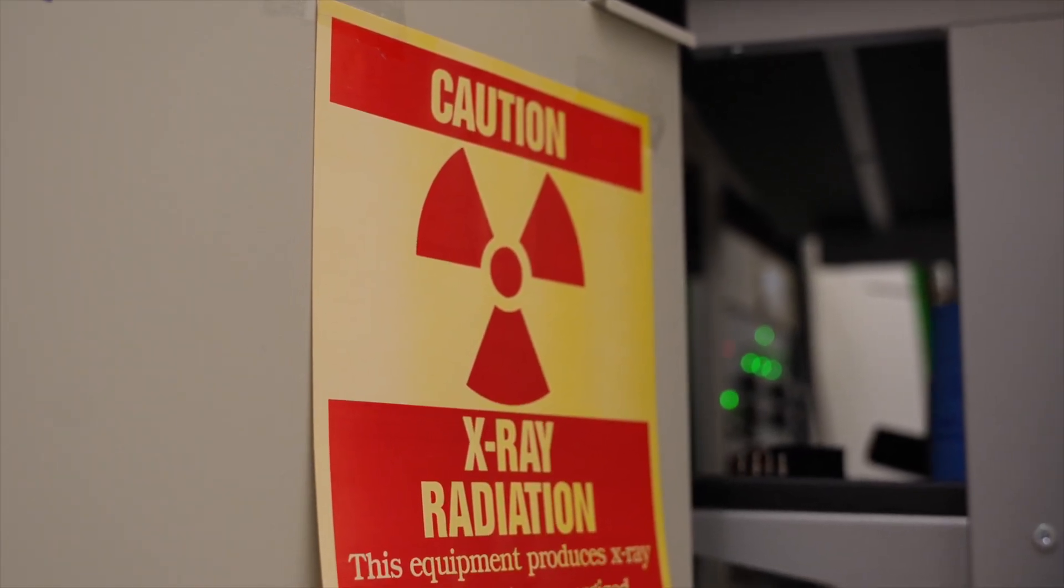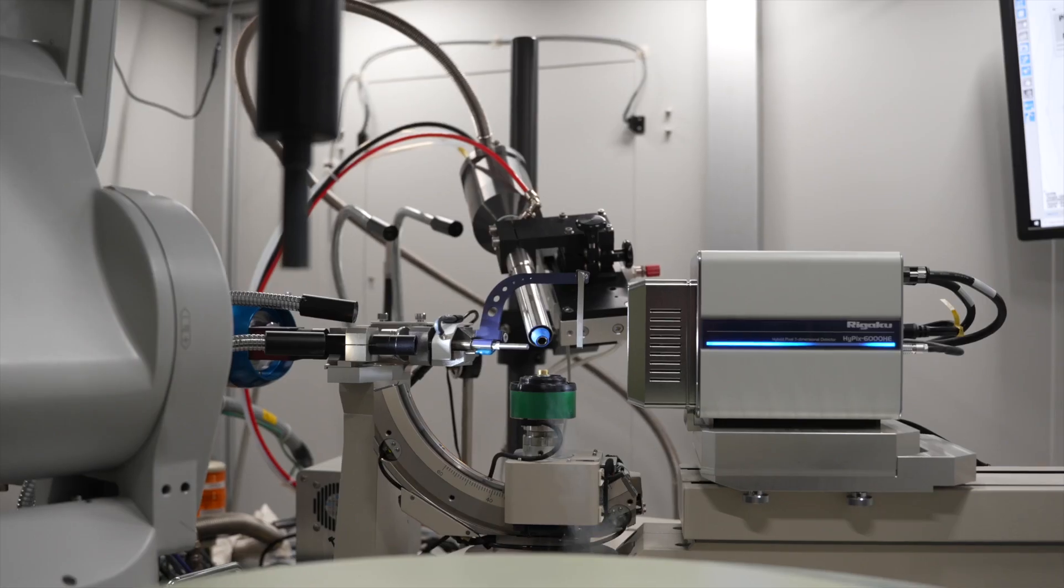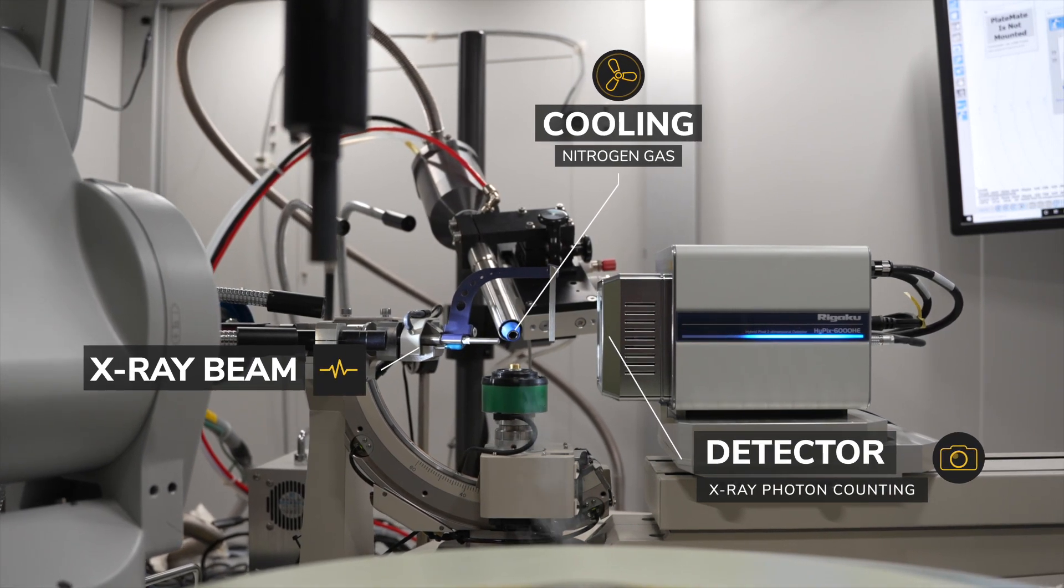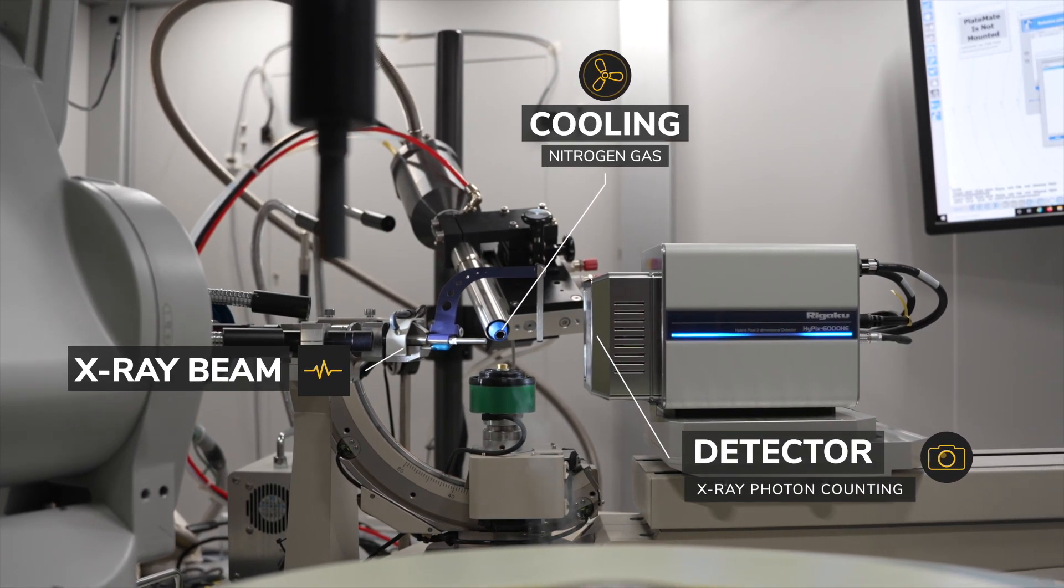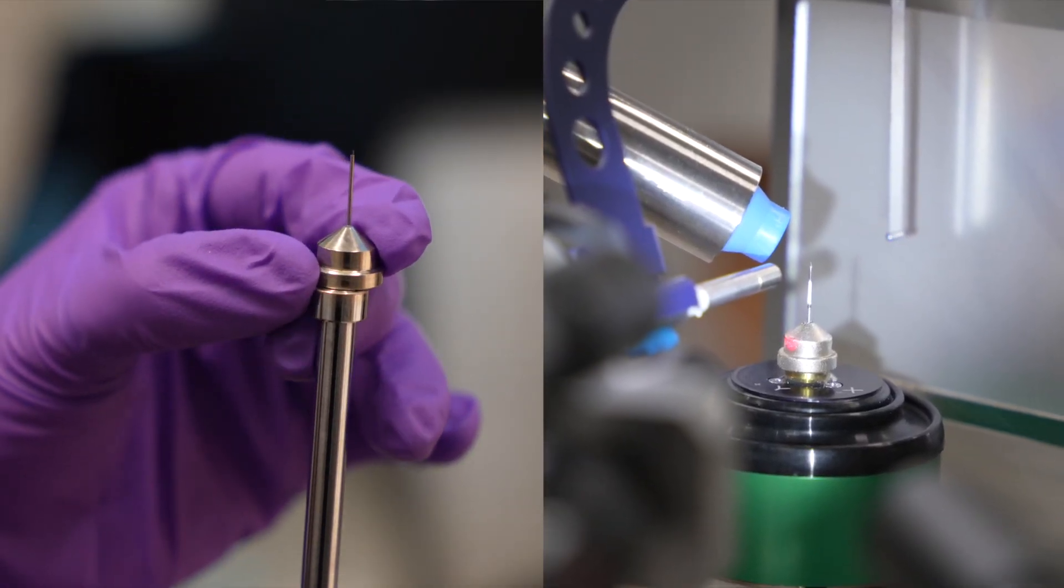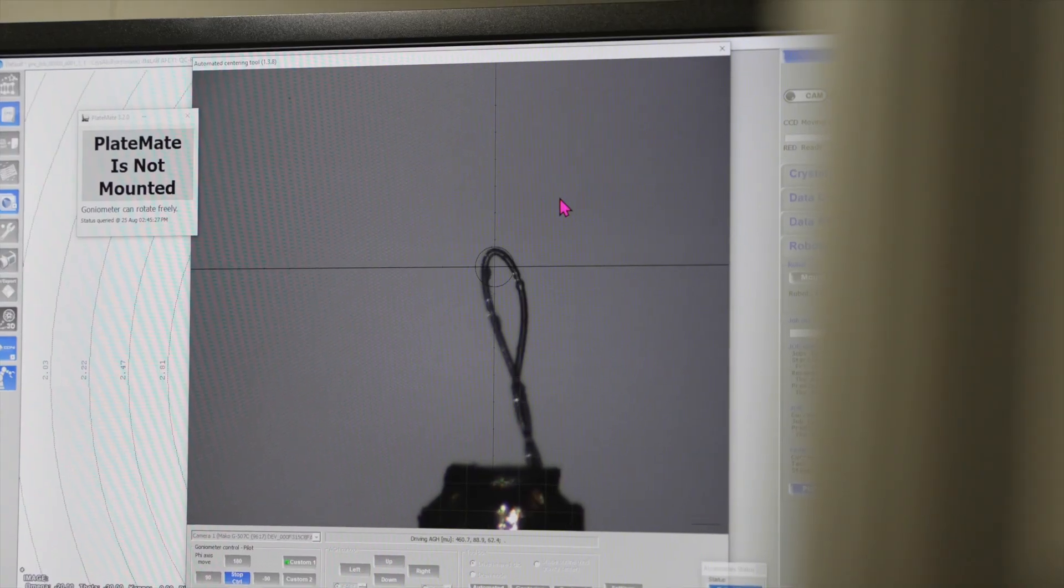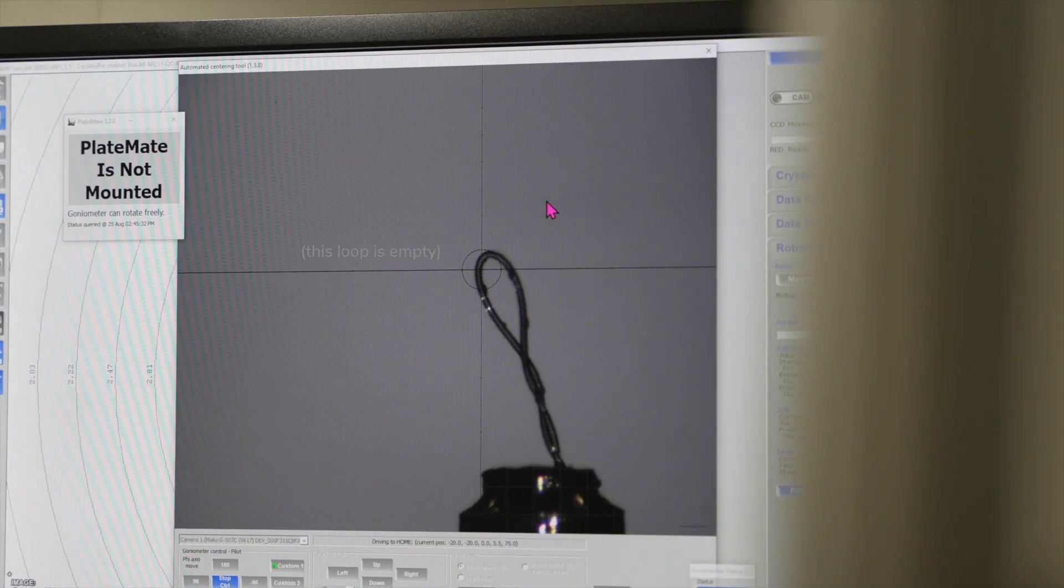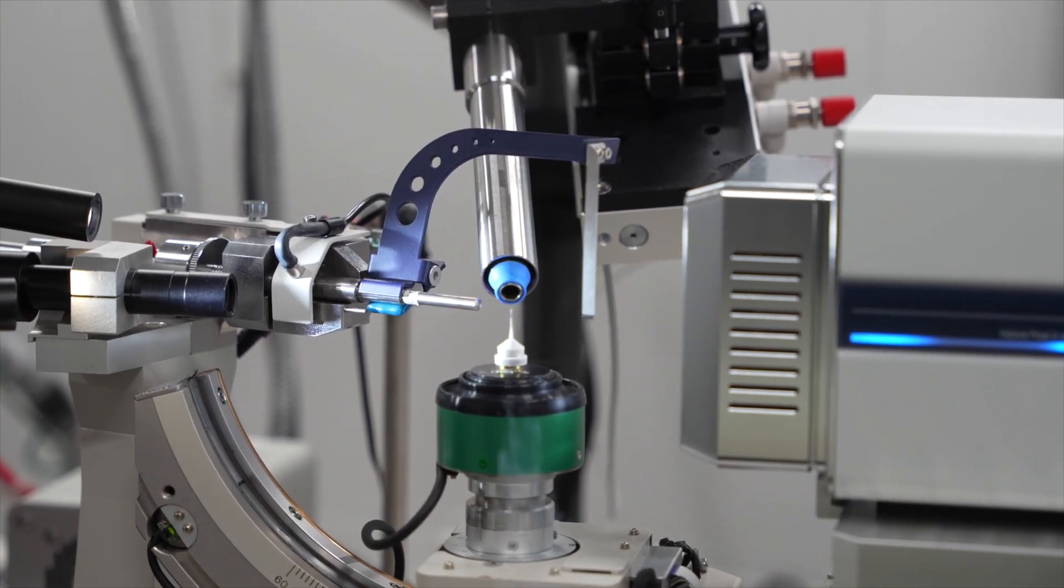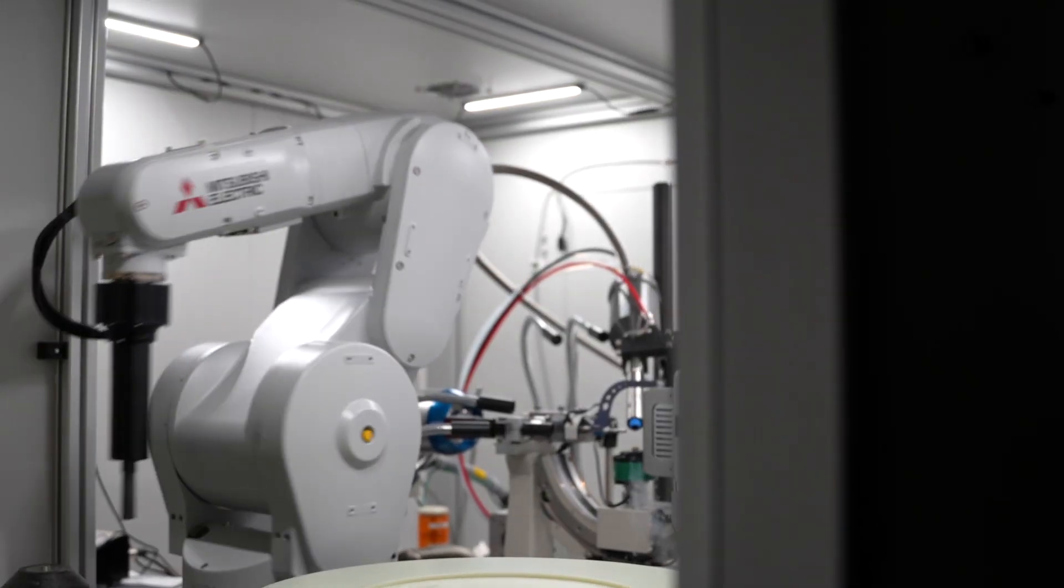Now that our crystal is frozen, we're ready to put it under an x-ray beam. This complicated machine can produce x-rays, blast the matter sample, and detect the x-rays on the other side. We place our crystal on something called a goniostat, which positions the crystal directly in the path of the x-ray beam, and allows us to rotate the crystal in space. We'll need to spin the crystal a full 180 degrees to make sure we capture x-ray diffraction from all angles. The crystal is kept under a steady stream of cold nitrogen gas, so that it doesn't heat up too much under the x-ray beam.